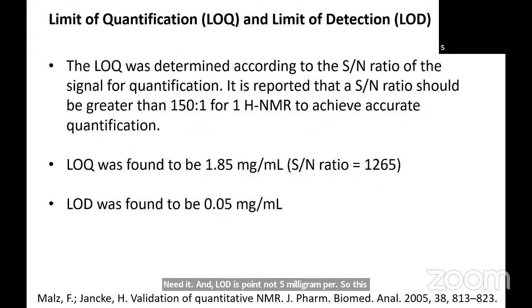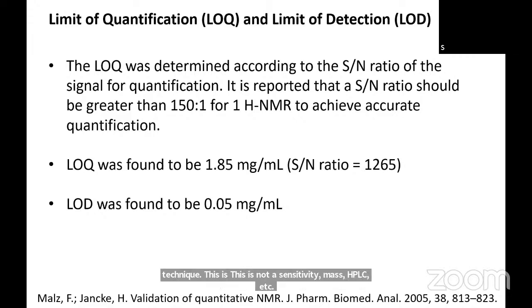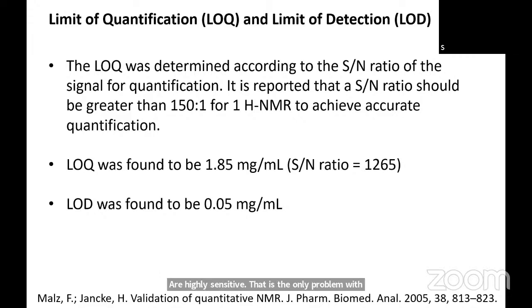And this should tell you one more thing. For HPLC analysis, limit of detection or limit of quantitation are in the microgram level. Okay. The only problem with NMR is not a sensitive technique. This is not a sensitive technique. Mass, HPLC, etc. are highly sensitive. That is the only problem with NMR. But if your sample size is good, then NMR can help.